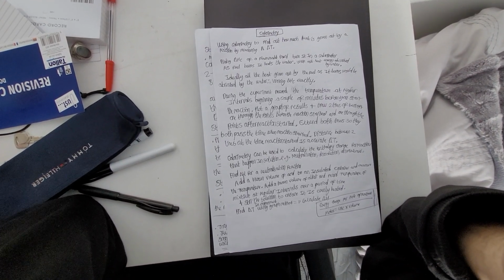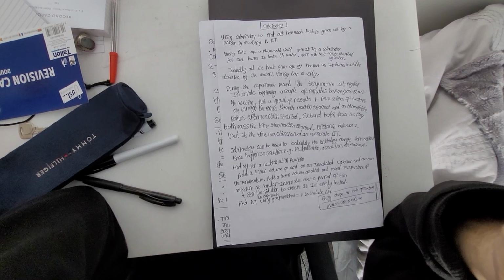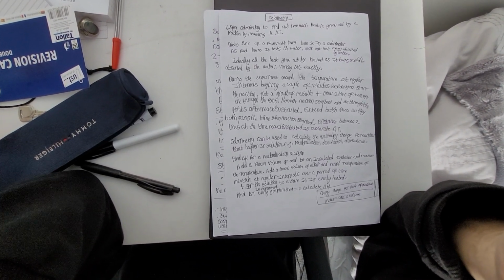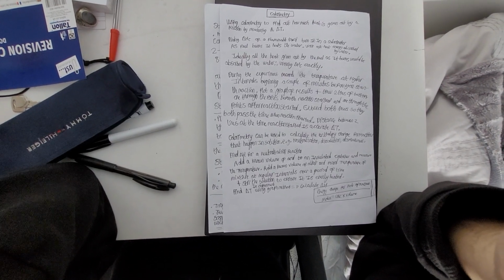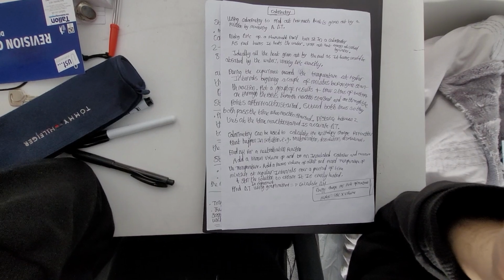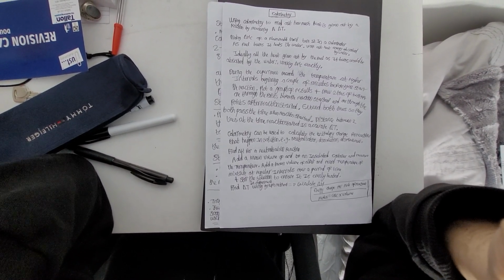It's incomplete combustion, and we lose heat then. And during the experiment, therefore, we need to record the temperature at regular intervals, beginning a couple of minutes before you start the reaction. Plot a graph of results and draw two lines of best fit, one through the points before the reaction started and one through the points after the reaction started.